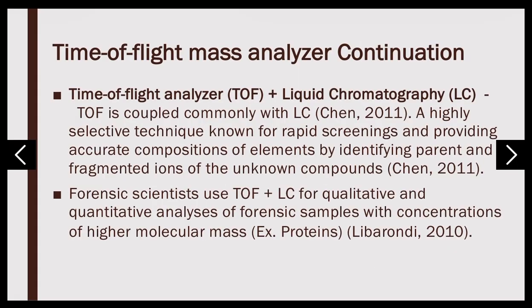Time of flight mass analyzer continuation. Time of flight analyzer (TOF) coupled with liquid chromatography (LC). TOF is commonly coupled with LC, a highly selective technique known for rapid screenings and providing accurate compositions of elements by identifying parent and fragment ions of unknown compounds. Forensic scientists use TOF coupled with LC for qualitative and quantitative analysis of forensic samples with concentrations of higher molecular mass.